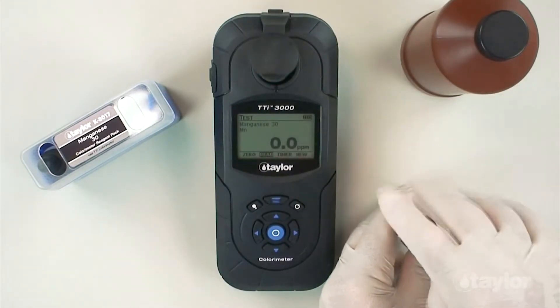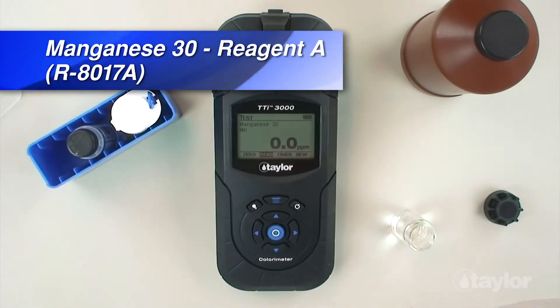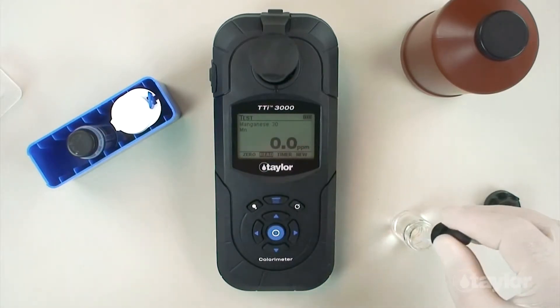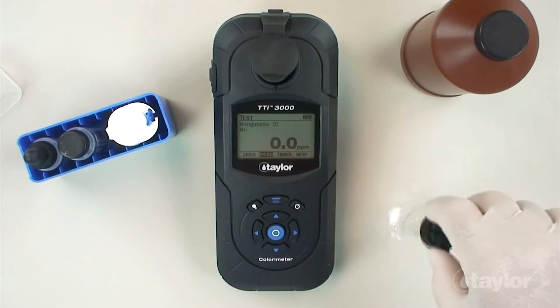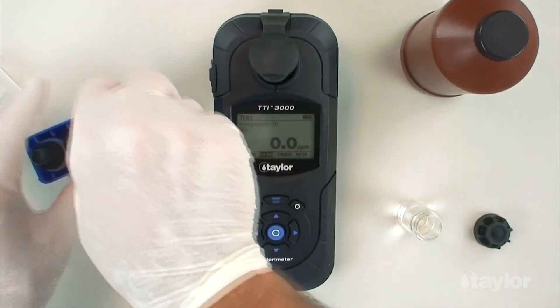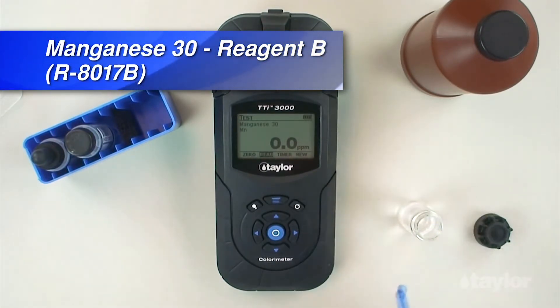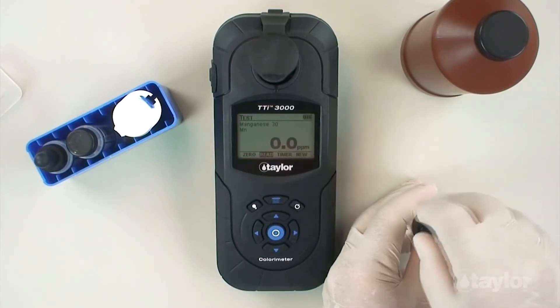Remove the sample cell from the sample cell compartment and remove the cap. Add 2ml manganese 30 reagent A and swirl to mix thoroughly. Using the 0.05 gram dipper spoon, add 1 level dipper manganese 30 reagent B, then cap and swirl to mix thoroughly. Note: a few small crystals may remain undissolved. This is acceptable and will not interfere with the test.